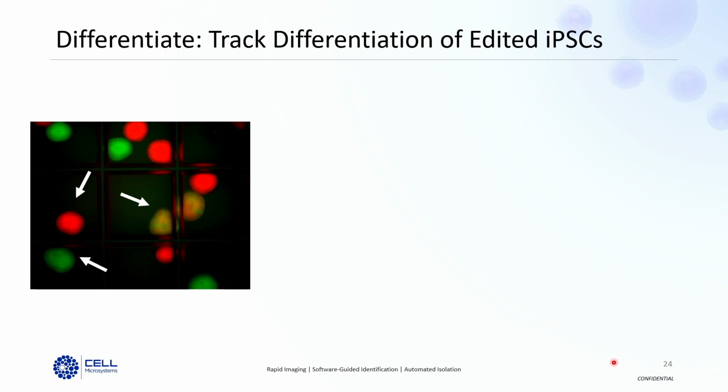As the closing to our iPSC discussion, I'm going to talk to you a little bit about some of the work that we've done with iPSC differentiation into organoids. We've done this with several different commercially available kits for generating kidney organoids as well as neuronal organoids. This particular one is a cerebral organoid kit. The workflow is really very straightforward, but what I'd like to point out here is that anytime we're doing organoid applications, we expect heterogeneity within our population.